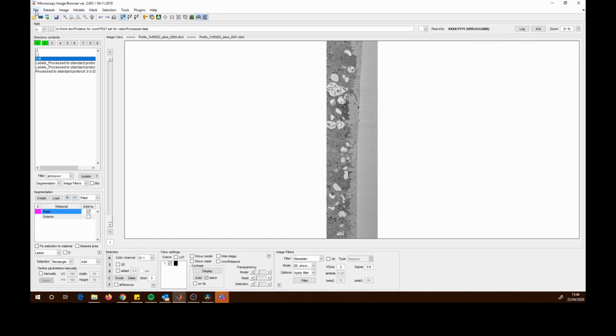If you save it as any of the formats like the AMIRA format, then there's other options. For example, you can save as an AMIRA Mesh Binary file sequence. You can also save PNG and JPEG formats as a file sequence as well. I won't go into too much detail about the other formats for now. TIFF is a good basic one to start off with. If you want to use some of the other formats, I'll assume you have some knowledge of image analysis already.